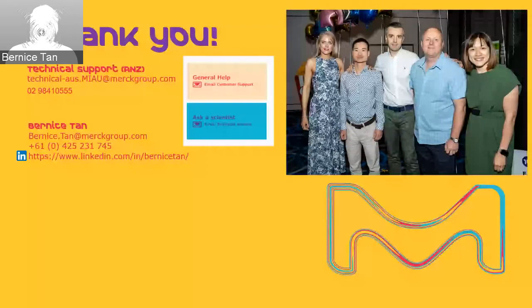So you can actually Google ethanol precipitation protocol for RNA or DNA. There should be some protocols, but if I've got your name there, I can send you a protocol that I used to use in the lab myself for cleaning up my samples. Great. We have the last two questions. How do I eliminate multiple peaks?